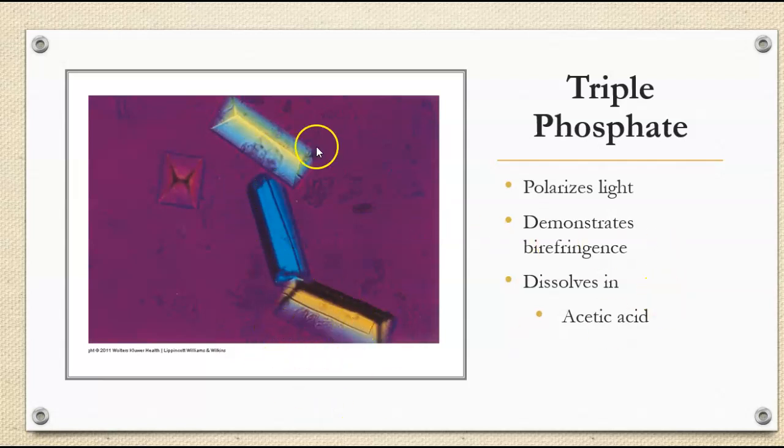This is one of my favorite crystals, just because I don't get to see them as often in the lab, and we don't actually have a polarizing filter in our lab. Although we did get new microscopes, so you never know.